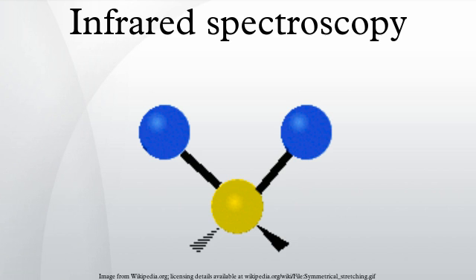Some vibrations, so-called combination modes, involve more than one normal mode. The phenomenon of Fermi resonance can arise when two modes are similar in energy. Fermi resonance results in an unexpected shift in energy and intensity of the bands, etc.